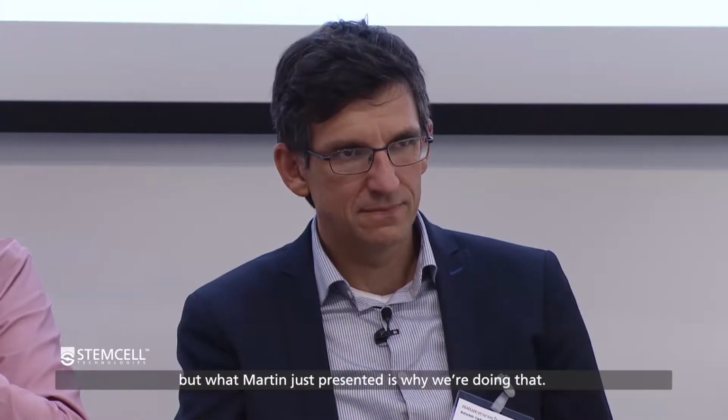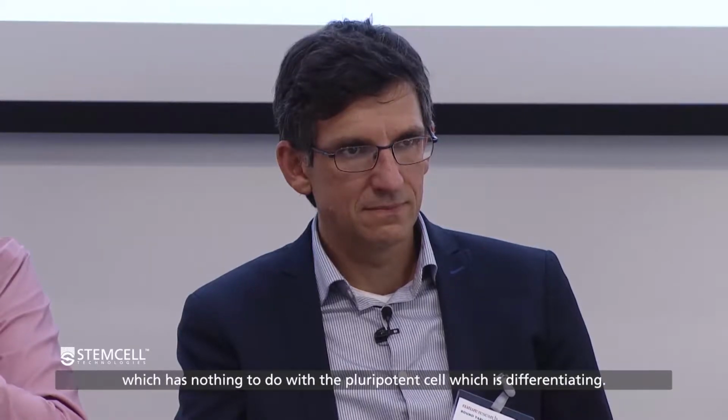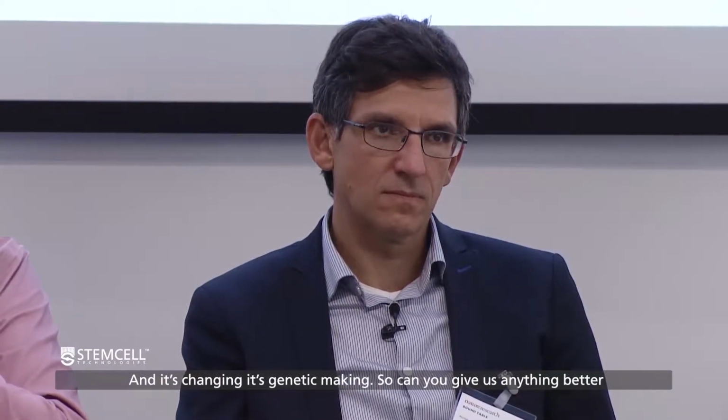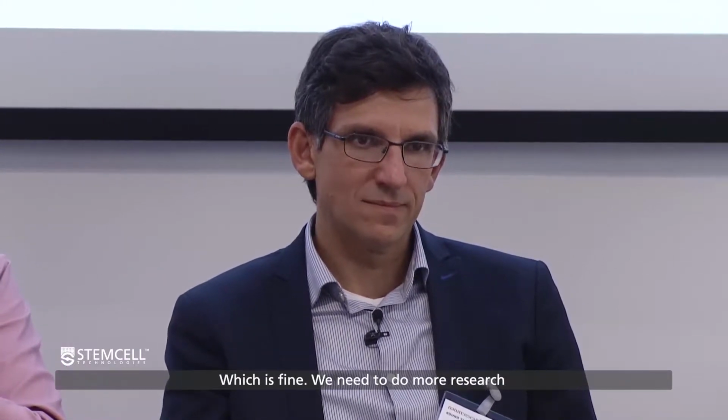But what Martin just presented is why we're doing that, because something may mutate further down that manufacturing, which is nothing to do with your pluripotent cell. It's a cell which is differentiated and is changing its genetic makeup. So can you give us anything better than we're doing at the moment? And the answer seems to be not really yet, which is fine. Means you need to do more research.